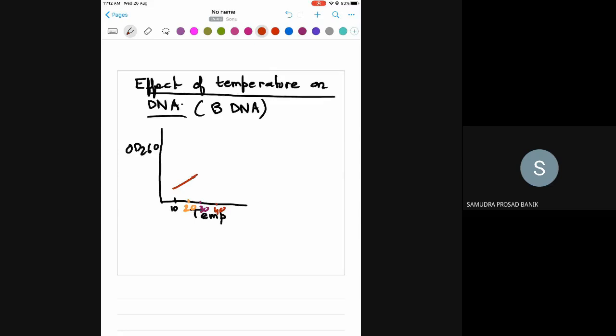Okay? So you have a slope change. We call this in technical terms the point of inflection. Anybody who has done these kinds of things in mathematics must know this point of inflection, where the slope suddenly takes a steep rise.